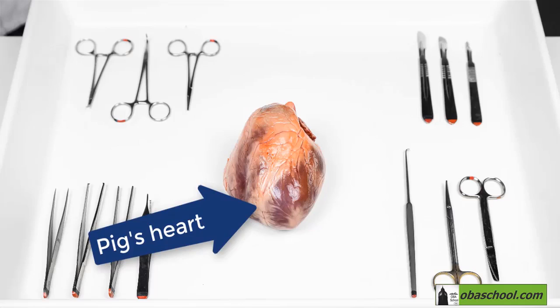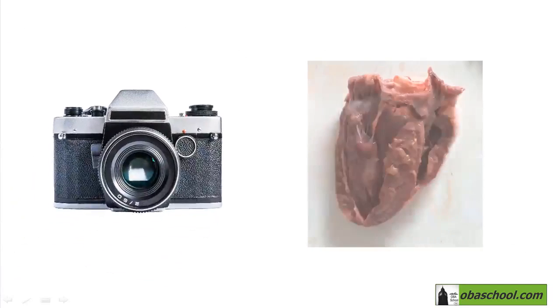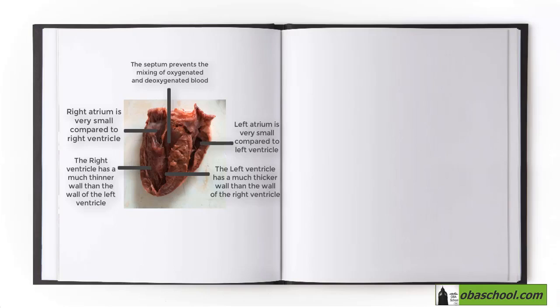Well, this practice provides us with an opportunity to present the results in a format other than tables and graphs. Actually, you can take a photo of the dissected heart and stick it to your lab manual. Then you can label it just like that.